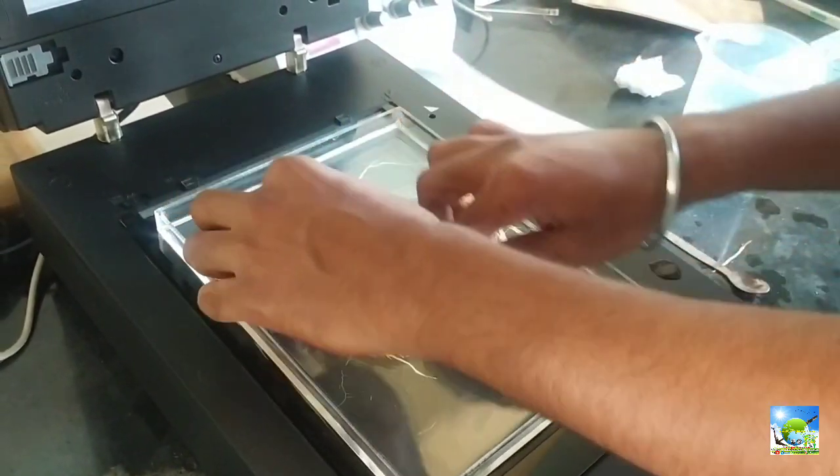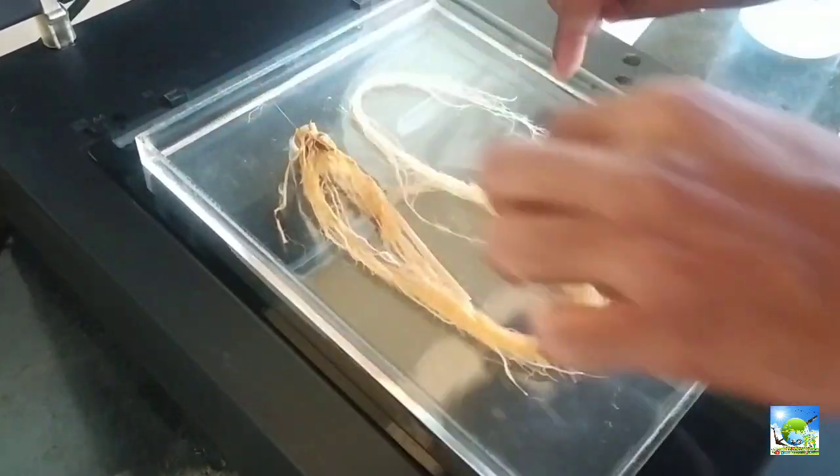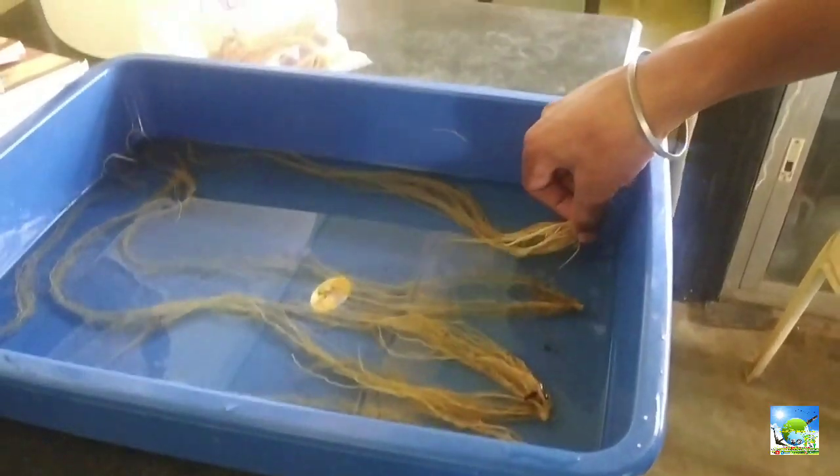This helps to write a good research paper focusing only on roots. For this, WinRHIZO software needs to be installed along with the root scanner and product key. Roots should be washed clearly without soil and dust.